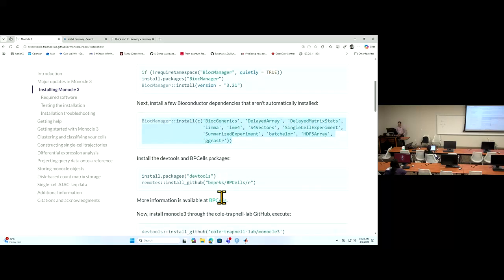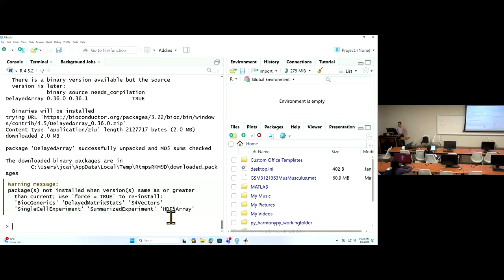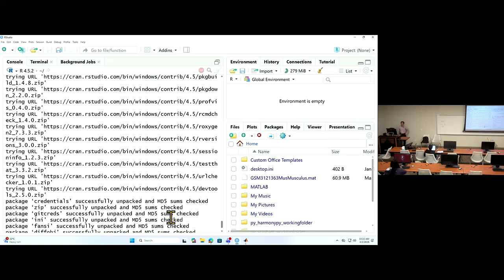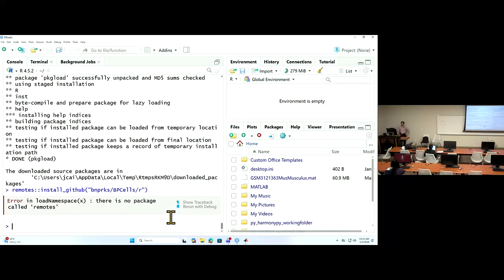So that's the place I copied. And this will take some time, I believe. Let's try. If I can do it.